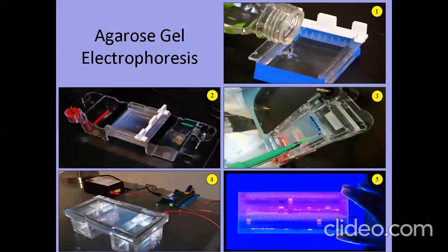I will take 100 ml of buffer, and will add 1 gram of agarose. Mix that and then boil it. After boiling, wait for a while so that the temperature lowers to 50, and it will still be liquid in form. And then pour it into the casting tray.